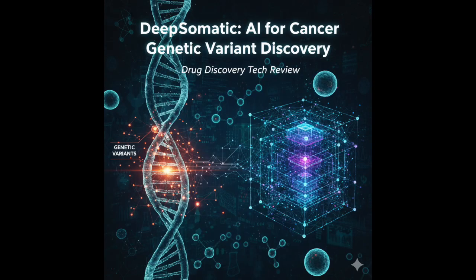Today we're doing a real deep dive into the world of cancer genomics. We're focusing specifically on a pretty ingenious AI tool from Google Research called DeepSomatic. Yeah, this one's really making waves. It's potentially a massive step forward for precision medicine. So our mission today is to really pull it apart, right? Look at the tech, the architecture.